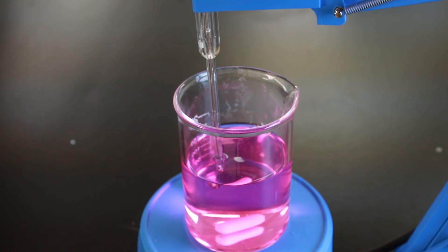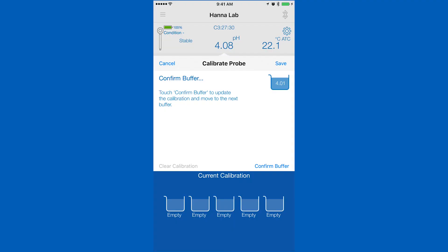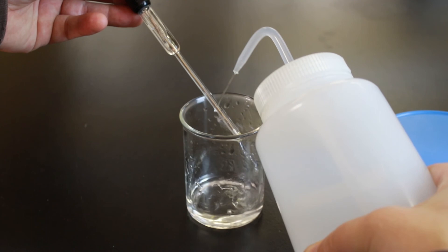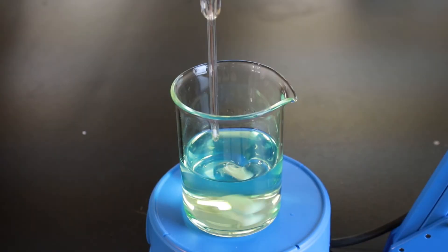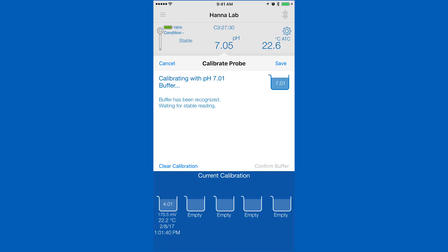Rinse and place your probe in your pH calibration solution and wait for a stable reading. Once stable, tap confirm. To calibrate the next point, we recommend that you rinse your electrode with deionized water to prevent contamination. Place in the next buffer and your saved calibration will be stored as the app begins calibrating your next point.